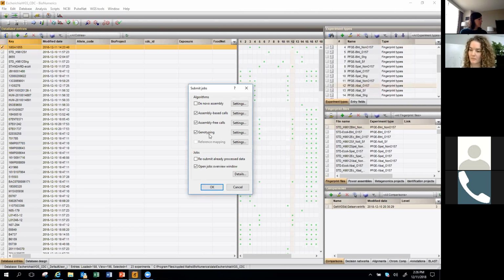So we're hoping that by sometime in the middle of January, you'll have access to the whole genome sequencing component, but you should all be converted, hopefully, to this version of BioNumerics for at least use for PFGE by the beginning of the year. Maybe at some point in early January. We're aiming for our January 15th, quote unquote, end of PFGE date.